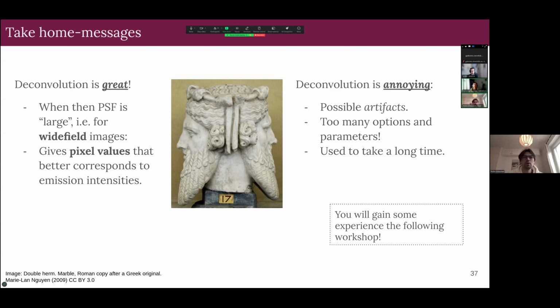When you listed the different deconvolution methods, you only had one method. I've used the Huygens software, and there you have, I don't know if it's 10 versions or at least five different versions. Will we go into how to choose the right one? No, not here, not today. But you're right.